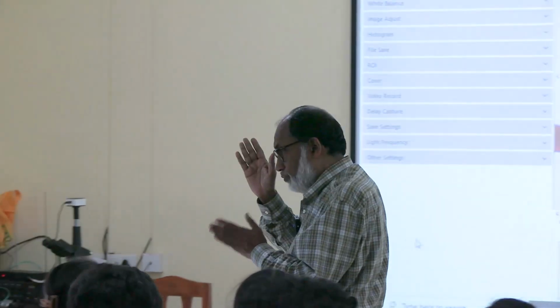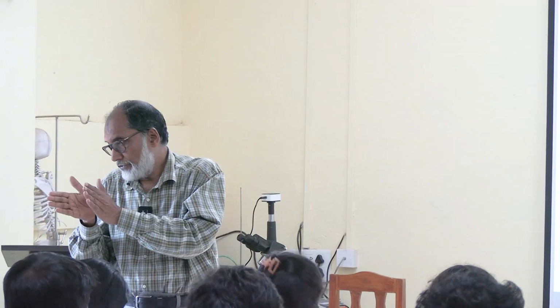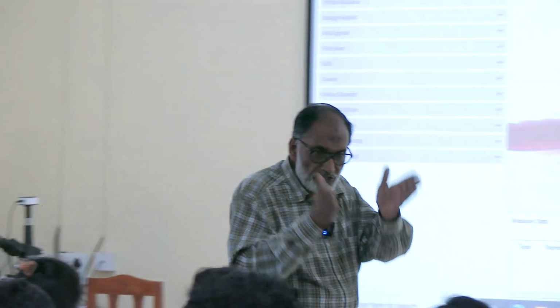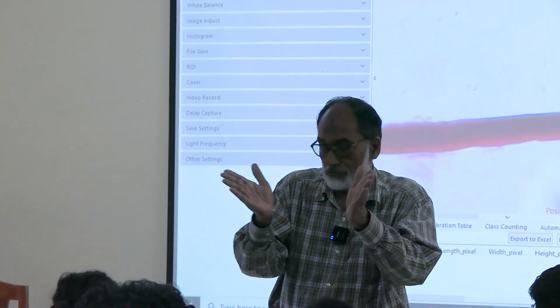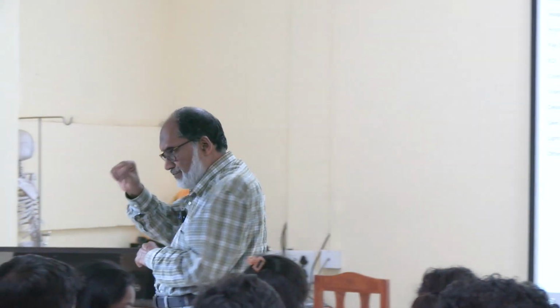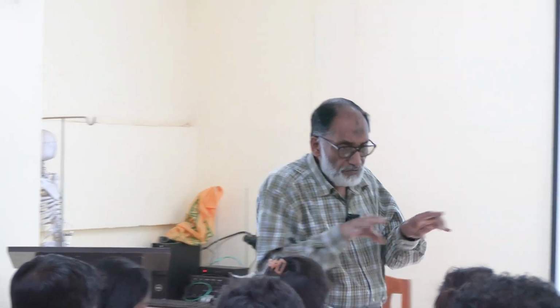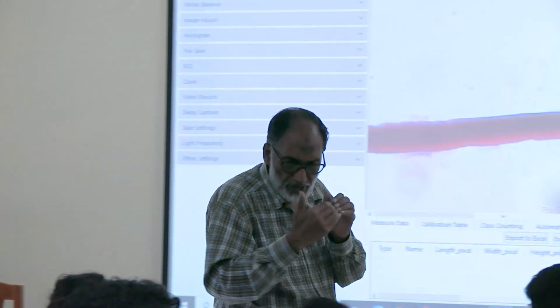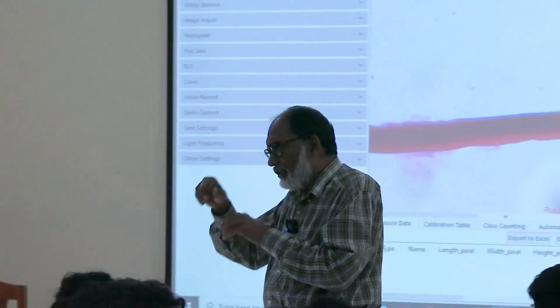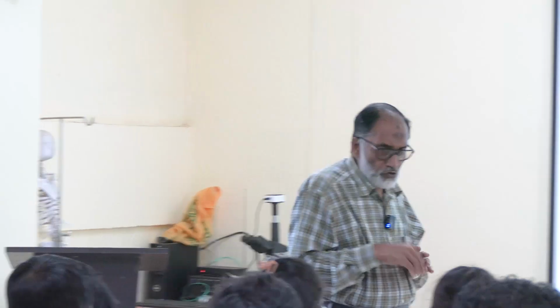The most characteristic feature of cardiac muscle is that it branches. You should see the branching of the muscle, at the end especially. And another important characteristic is the intercalated disc. Where two muscle cells are joining, there you will get a zigzag intercalated disc.